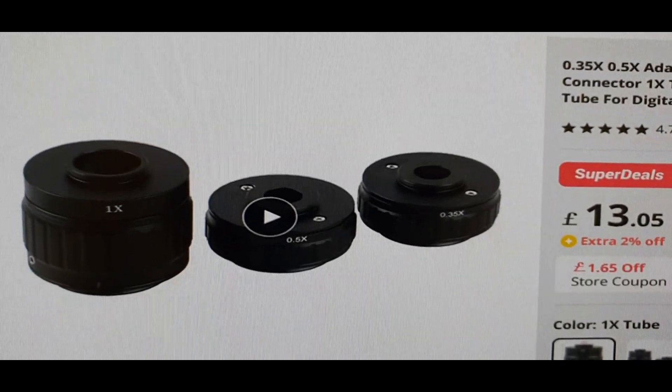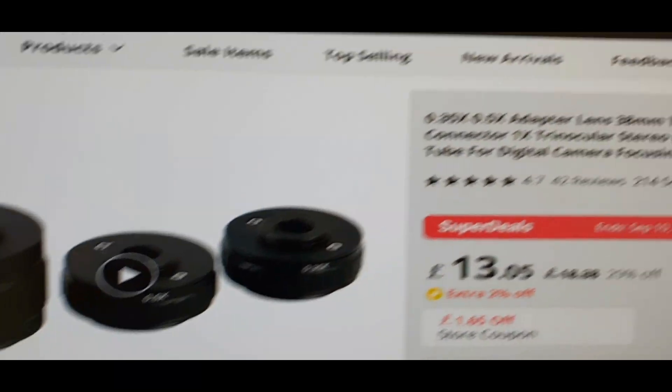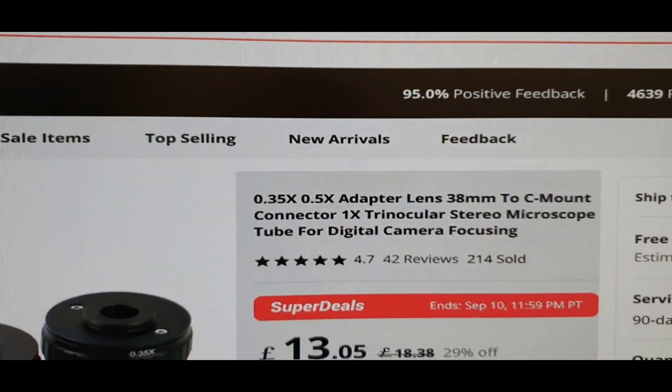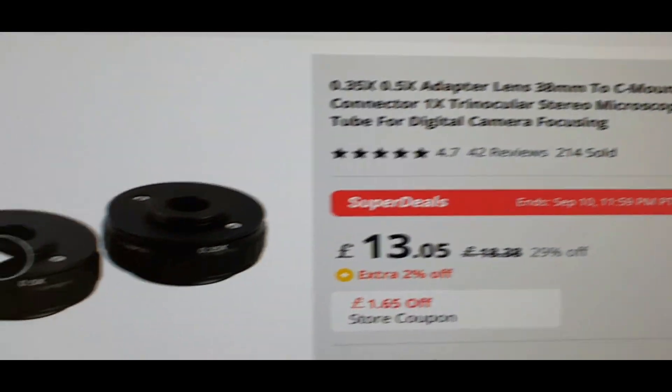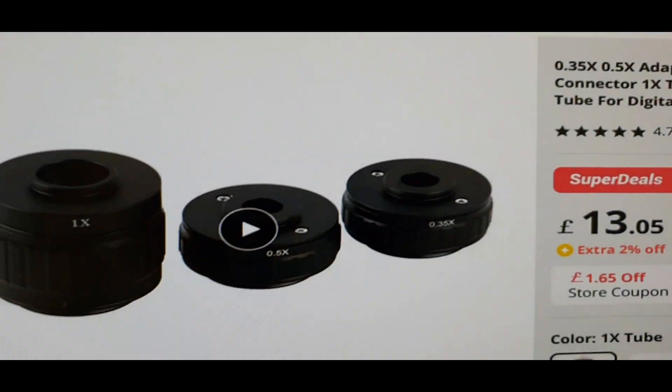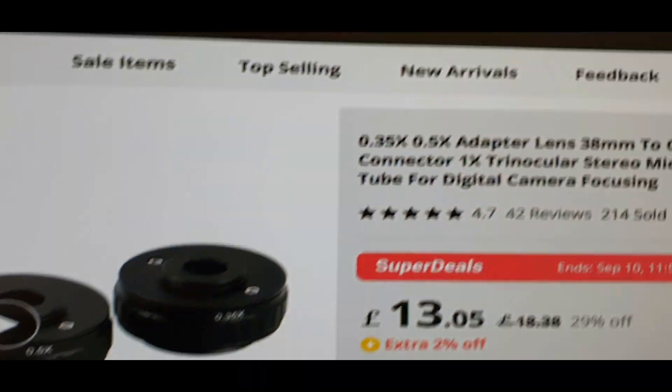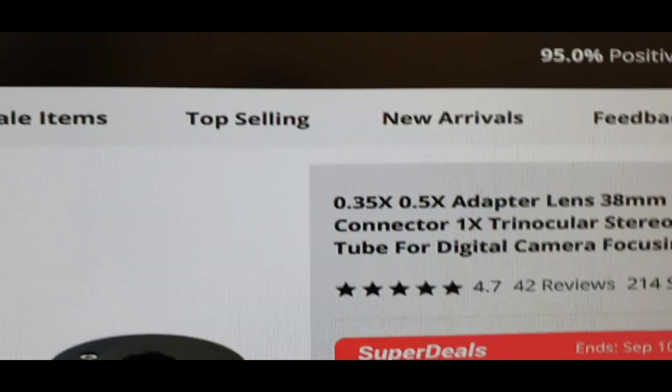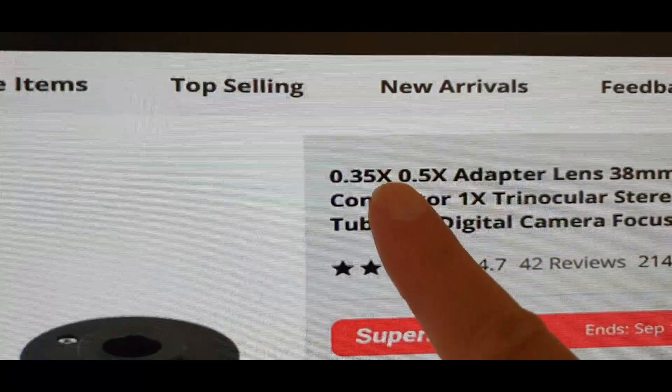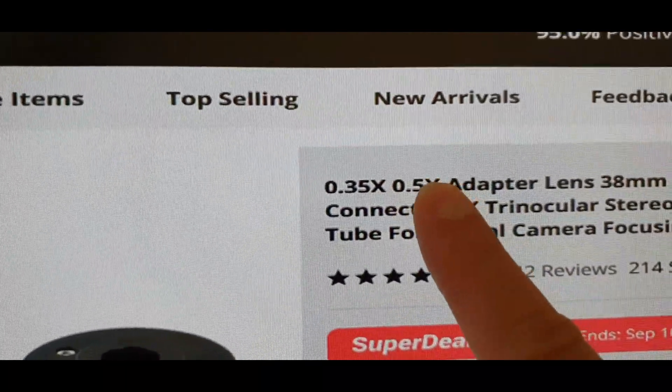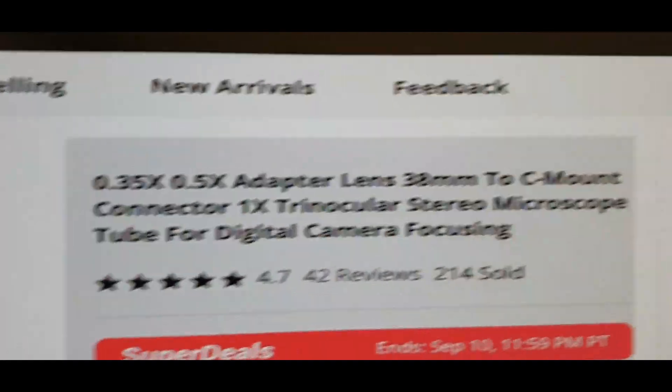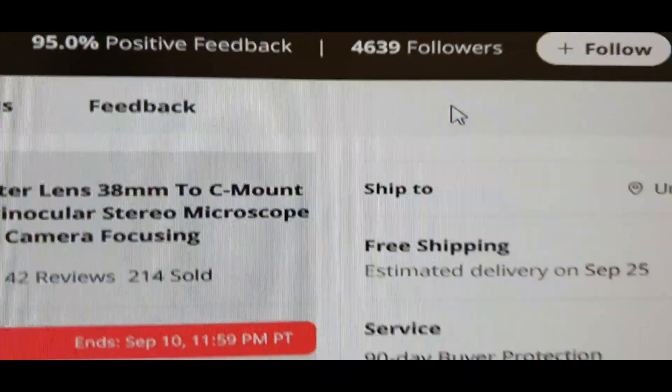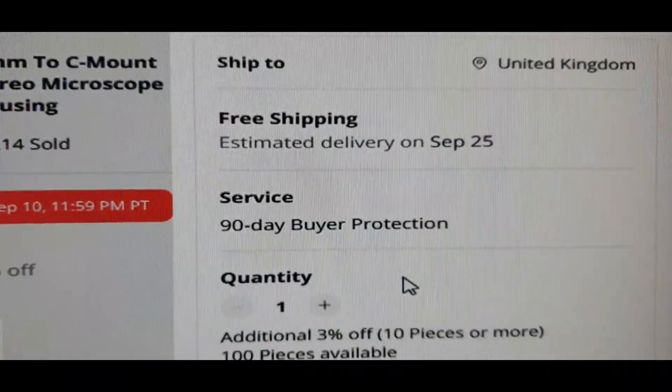I ordered this for my scope for the camera. I bought this one. That's not what I ordered.